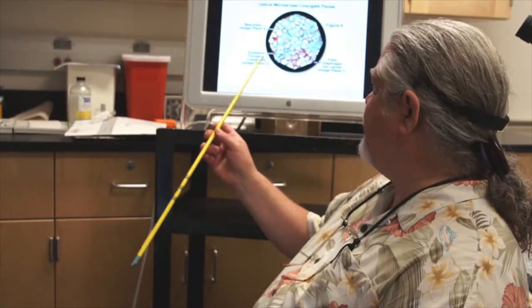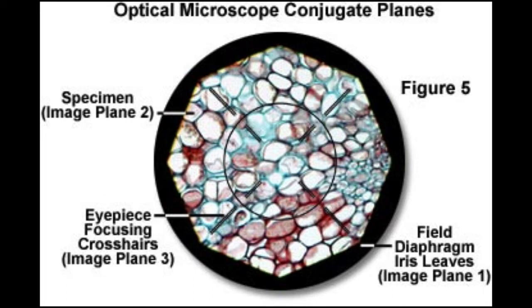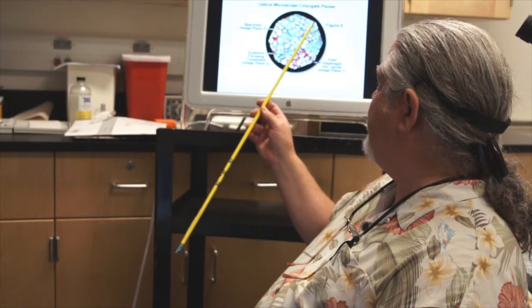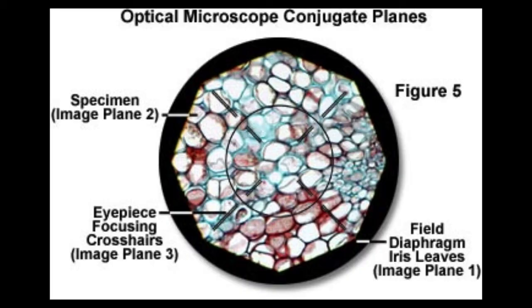That looks something like this. Here you see your field of view, you see your specimen in focus, and you see the leaves of the field diaphragm centered to the field of view and highly in focus. In order to perform this alignment you have to close your field diaphragm down until you see it in the field of view.